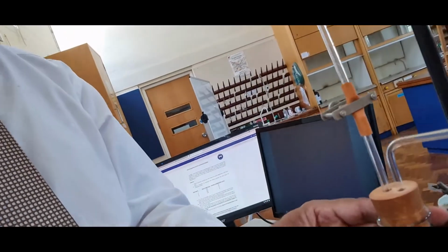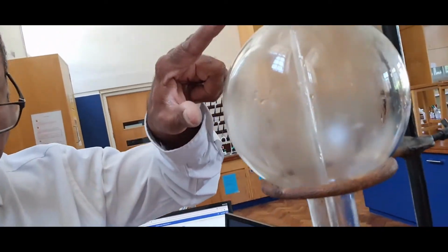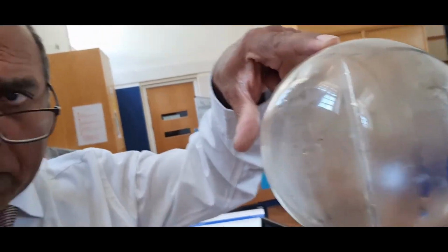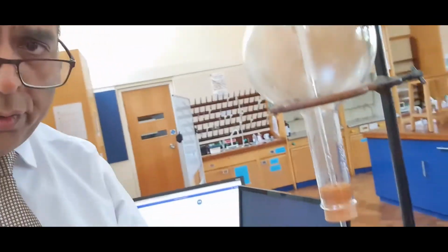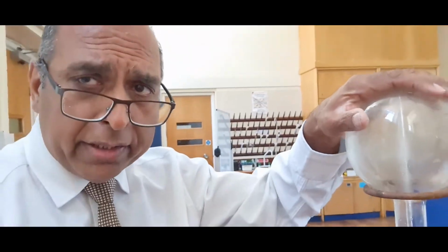When I open the tap, I might have to blow to get a little bit of the water coming out the end. But when a little bit comes out, then the ammonia should dissolve into the water, and as the ammonia dissolves, then there's less ammonia in that top flask.